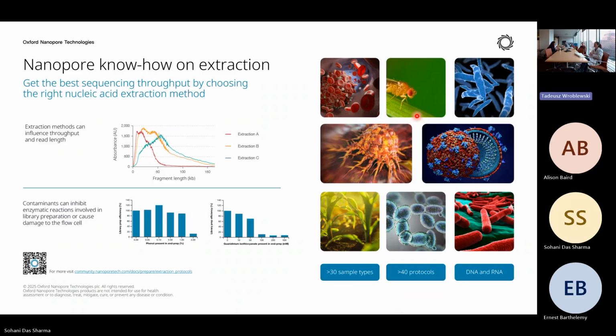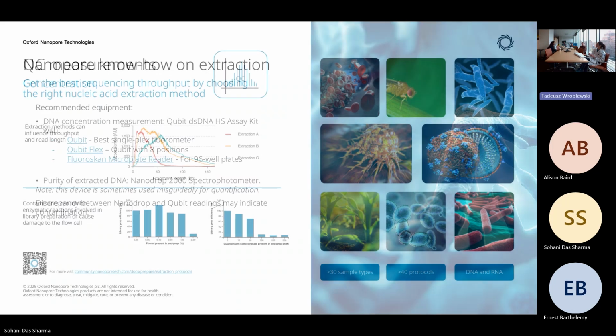I think yesterday we discussed the next thing you can try: double-sided bead cleanup, and try to make it cleaner so that we have more abundance of cfDNA, like mononucleosome and dinucleosome peaks, and not really high molecular weight peaks. That way we can probably achieve more coverage, if our guess that those high molecular weight peaks are actually gDNA is right. It's kind of hard to analyze it from there.